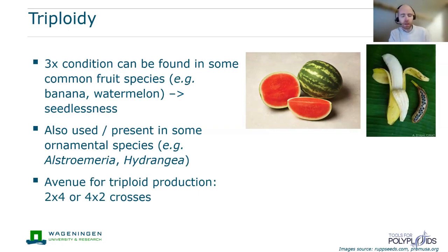So polymapR has been set up to also map triploid populations. It's not something I've shown here at the SCRI sessions in the past, but I thought it would be nice to finish off for this year's workshop to look at the capabilities of cross-ploidy populations in polymapR.